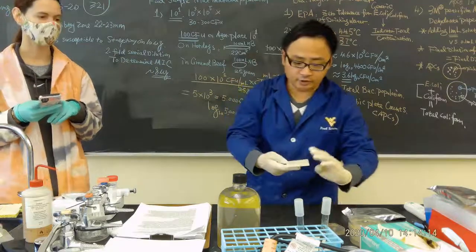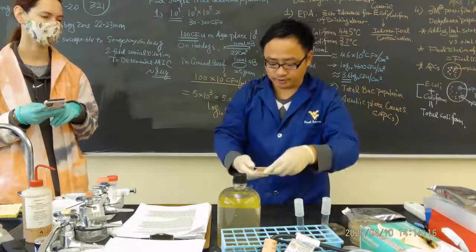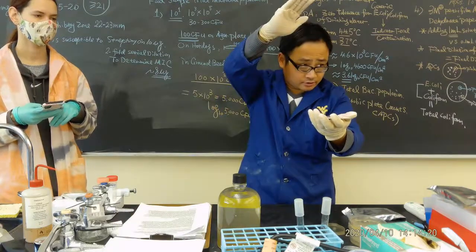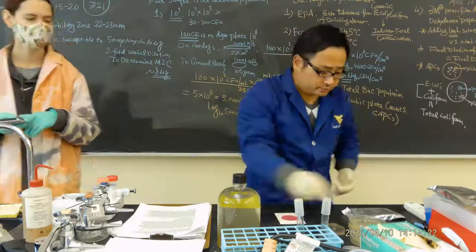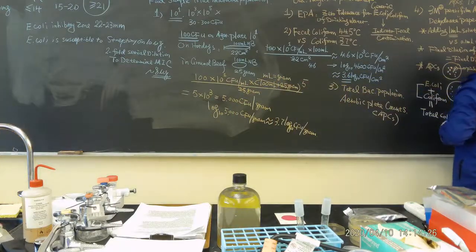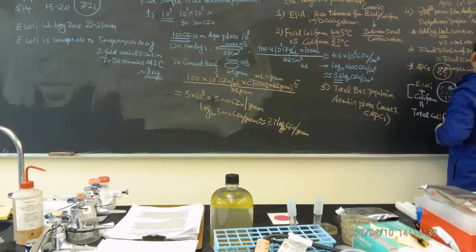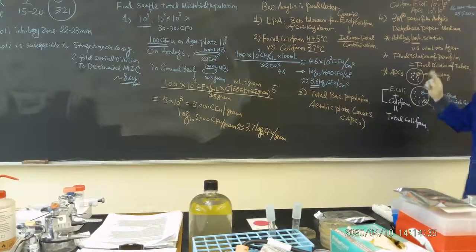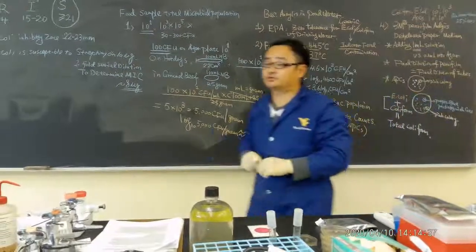Okay? Then we do an incubation. We can put them together, but you can't stack too many. Usually, the stack is no more than 25 pieces. Okay, when you do the stack, no more than 25 pieces.